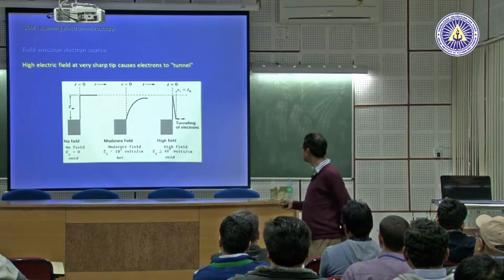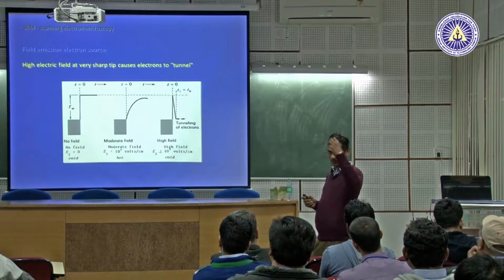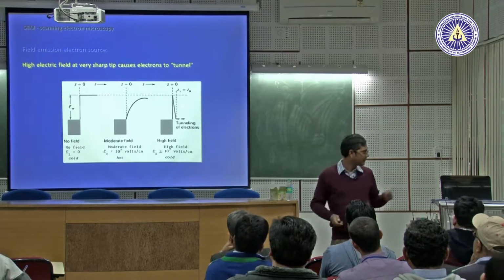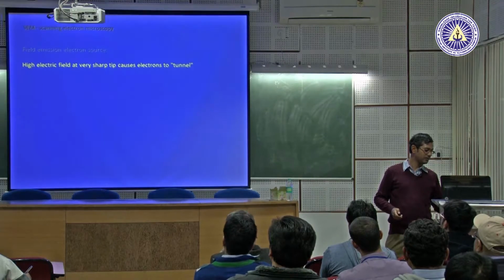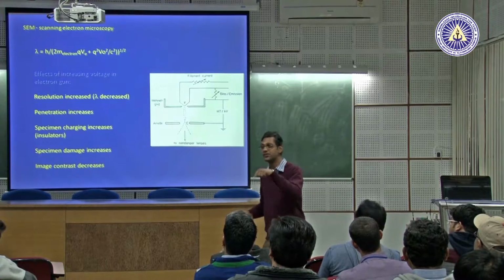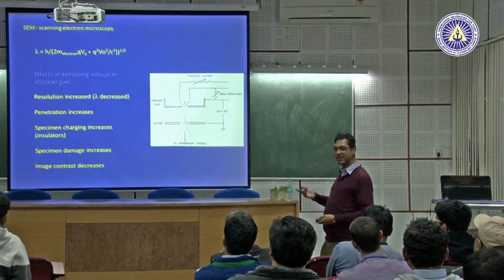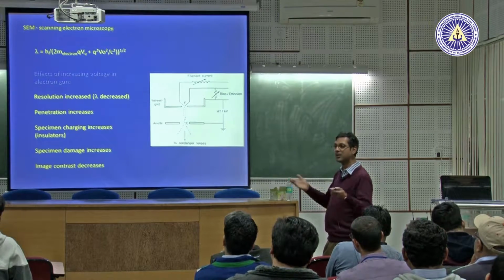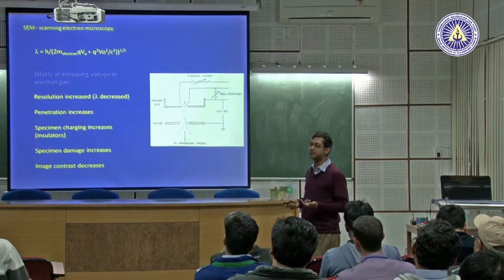Two reasons. One is that this is a crystal, a fine crystal of tungsten. It is made in such a way that the tip of this crystal is along a certain crystallographic direction. What is that? The tip of this crystal is along the <310> direction of tungsten. Why? Read it. The work function of tungsten or of any element depends on crystallographic directions, because electron availability varies on that. So making this crystal is expensive.